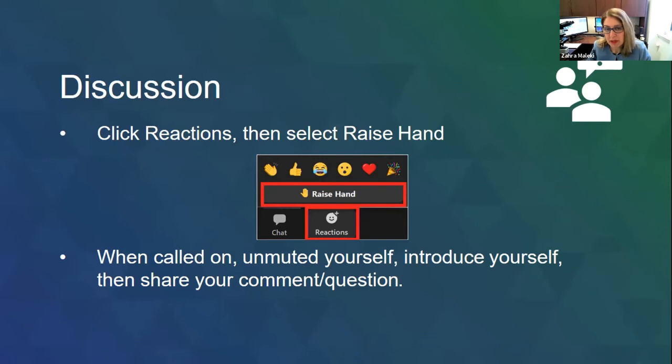If you would be able to actually do the processing of the tissue and send formalin fixed, paraffin embedded material, I think probably that's the best way, because having a block would be much safer in terms of transportation than transporting any type of fluid in general. And so that can be simply done, I think, in any labs, and then you actually send the cell blocks. So I think that's probably the best way.